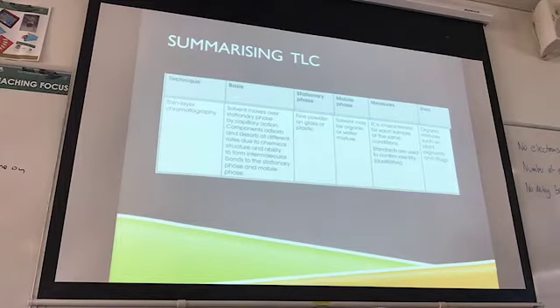That happens at different rates depending upon the chemical or the intermolecular forces between the solvent, stationary phase and the analyte, the material that we're trying to analyse.